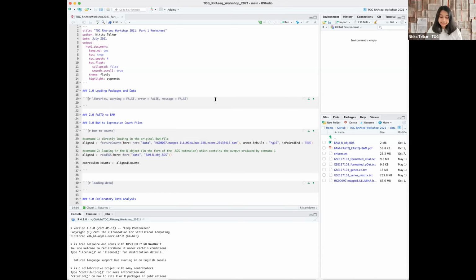Yes. What I would say is that it's much easier to get all of your trimming done before you put it into any alignment software. Personally, I found that if you just put in the sequences that are ready to align, that performs much better than having to trim or do all of these extra functions in STAR, which is the aligner that I use, and it's quite good for small RNA data.